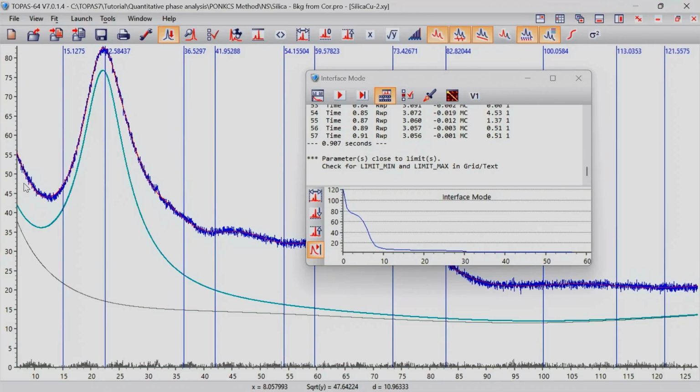Remember what the Rietveld method is using to calculate phase amounts? We have, of course, a scale factor for each phase, and then we have this important group of parameters, ZMV. Remember that? Z is the number of formula units, M is the mass of the unit cell, and V is the volume. These parameters are calculated from the known crystal structure. If you don't know the crystal structure, what could you do?